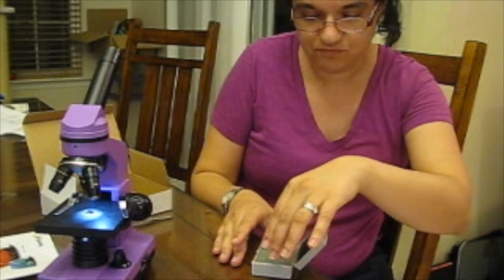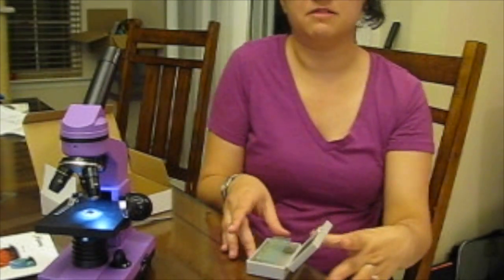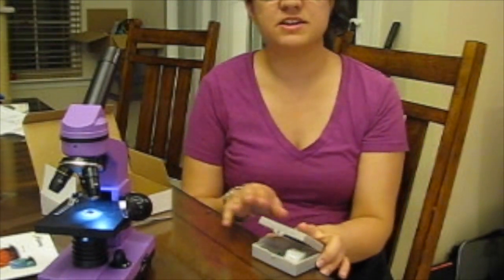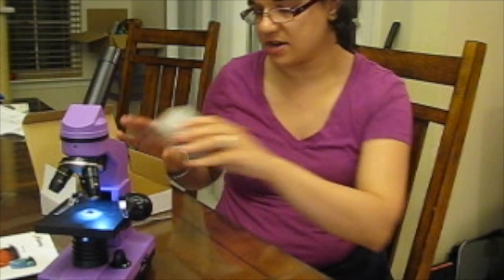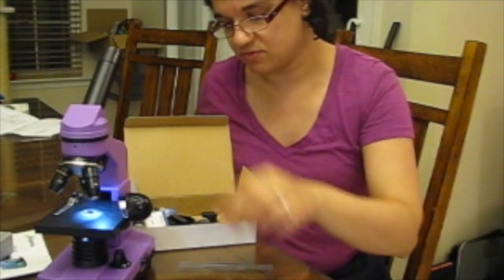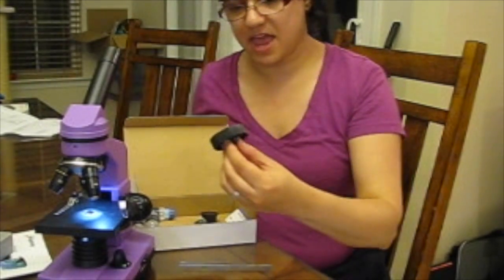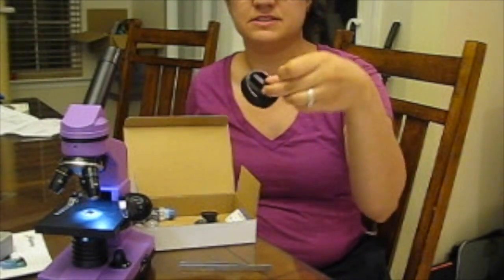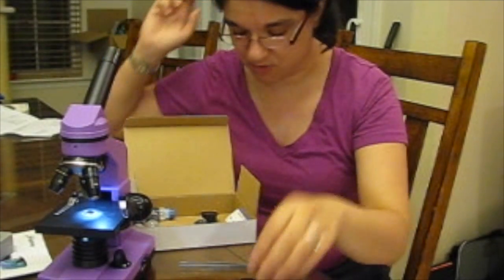And there are several blank slides that can be used for the included experiments or just going off on your own and experimenting. So we also have a pair of tweezers, which is useful. A tool for cutting thin slices of materials to make your own samples.